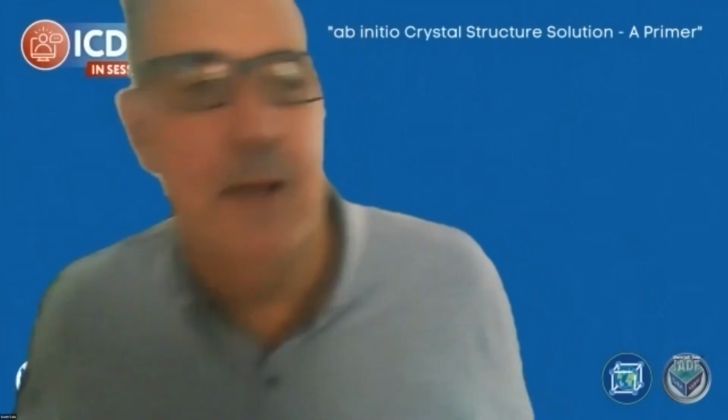Are the Rietveld refinement results obtained through Jade comparable to those with the FullProf suite or any other refinement tool? Well, since ultimately you're trying to do the same mathematics, they should be. And when I have compared, they have been. So, I mean, you would expect some variation, I think, just for almost statistical noise.